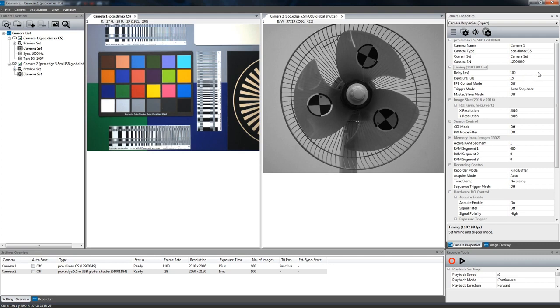Easily change the time base by clicking here, and the respective window opens. The time base can be set to nanoseconds, microseconds, milliseconds, or automatic.